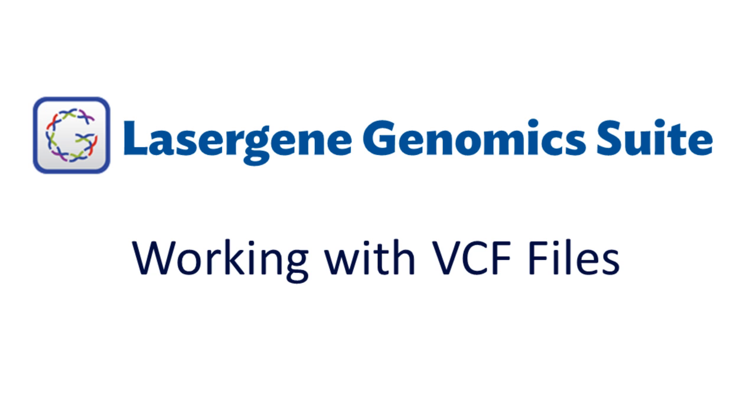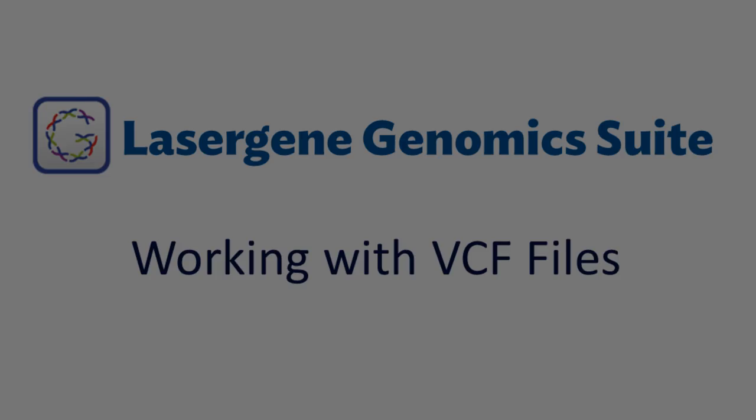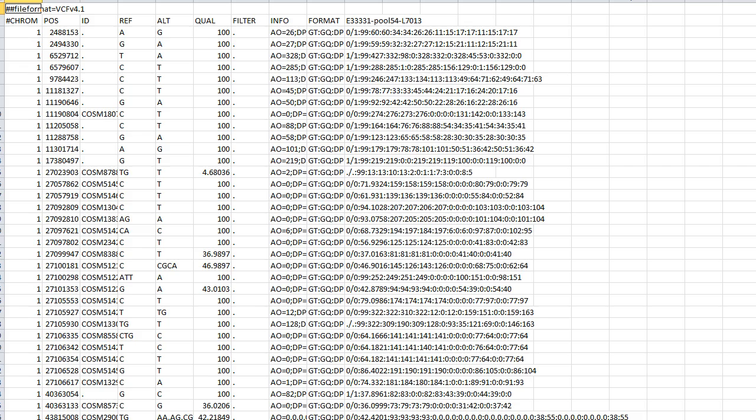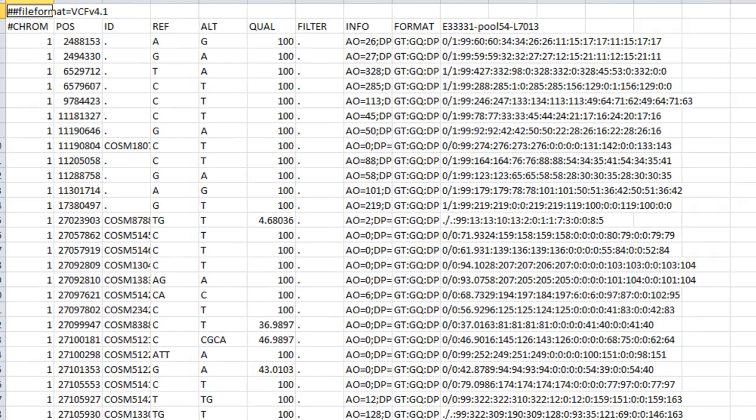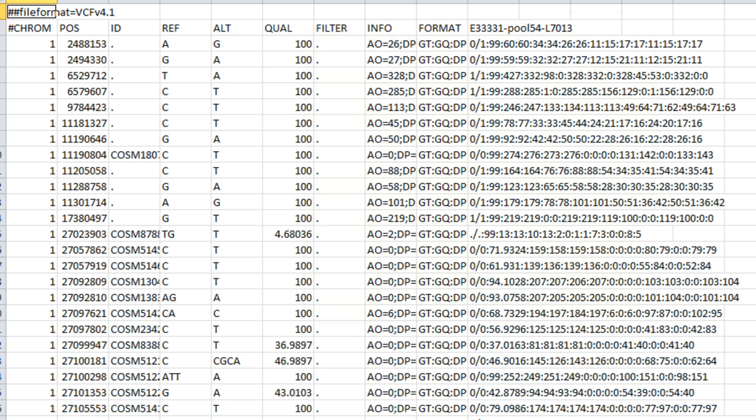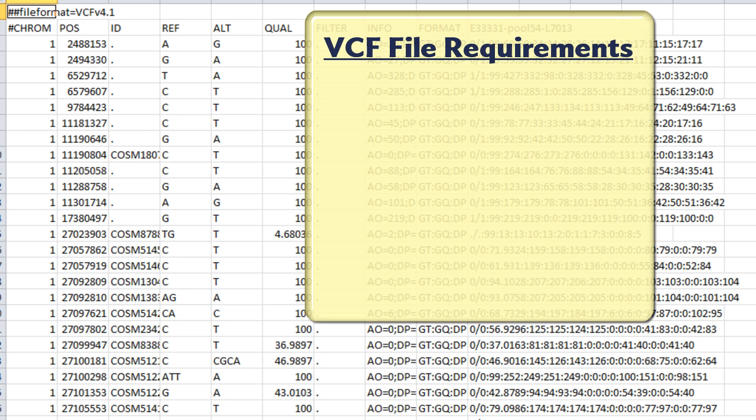In this video, we will look at how to use VCF files for SNP analysis in LaserGene Genomics Suite. There are a few basic requirements VCF files must meet to work with LaserGene Genomics Suite.